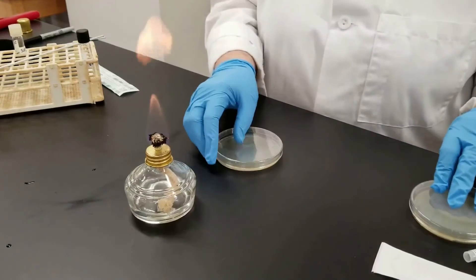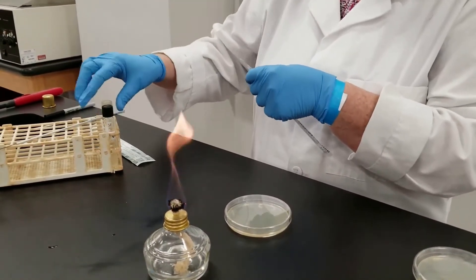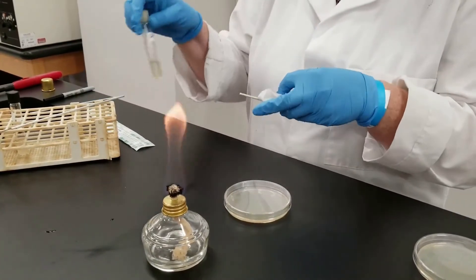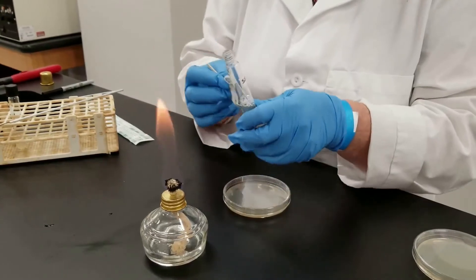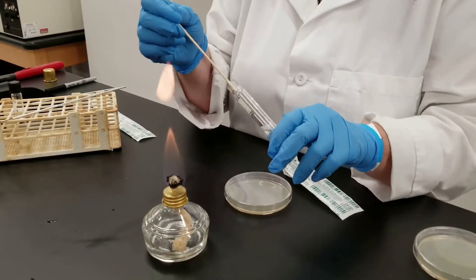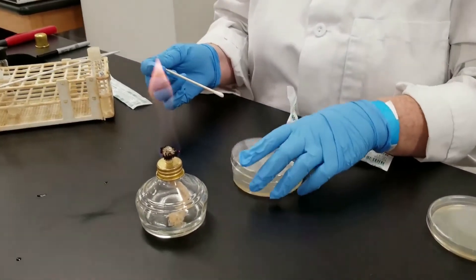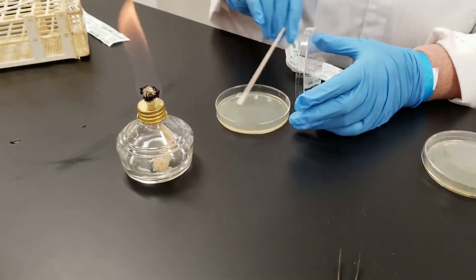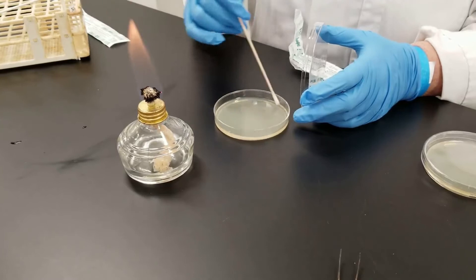Then I have the second plate with Staphylococcus aureus. Oftentimes with liquid cultures, if they've been sitting for a while, it tends to precipitate down at the bottom, so you want to shake the tube up a little bit. I'll do the same thing with this culture: flame the tube, remove the cotton-tipped applicator, press to get off the excess fluid, flame the tube, and cap it. On this plate, just like the other one, I want to get a nice lawn — complete solid growth — so you go in multiple directions. You can turn the plate, then go around the edge like this.